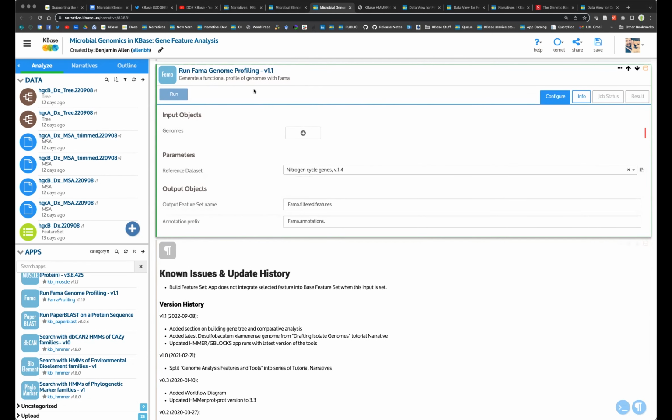But we're actually going to focus more on feature profiling in the next Microbial Genomics webinar, where we're going to talk about domain annotation, building functional profiles. And that's all. I'll show more of this stuff in the next webinar.